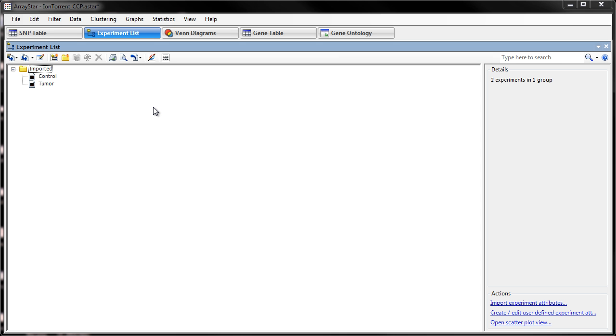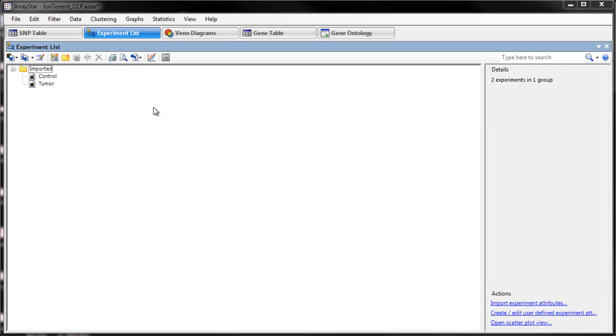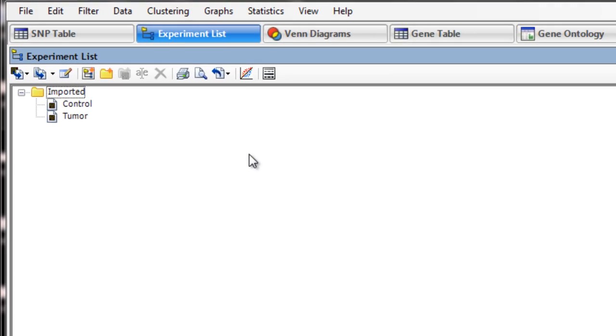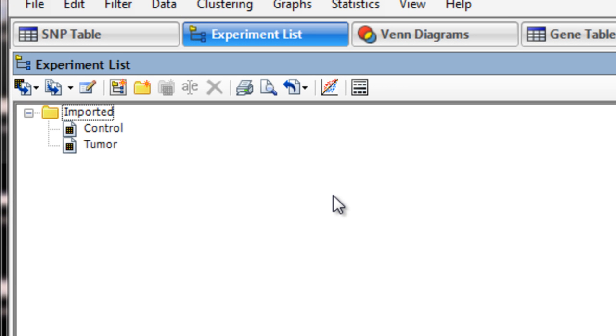You can also use VCF files for multi-sample SNP analysis in ArrayStar. Here, I have loaded a control assembly and a tumor assembly into my ArrayStar project.